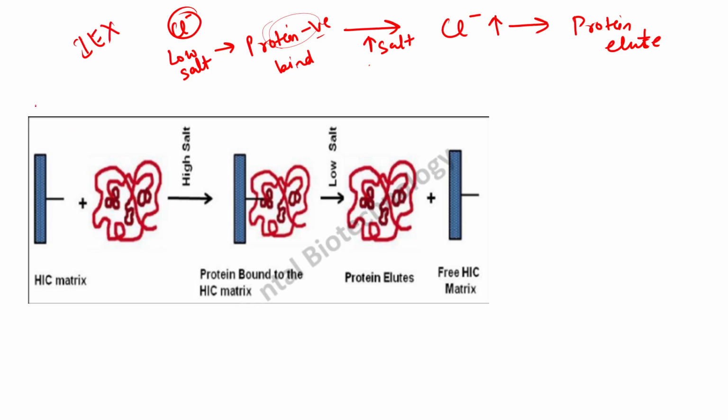This is HIC. So what is happening in HIC? We have a hydrophobic interaction. So the interaction is based on hydrophobicity. So you have to basically reduce the hydrophobicity and increase the hydrophilicity. Hydrophobic and hydrophilic are related to polarity. More polarity means more hydrophilic. Less polar, non-polar, means hydrophobic. Non-polar solvents will be hydrophobic in nature, they won't dissolve in water, and polar solvents will be hydrophilic in nature, they will dissolve in water.